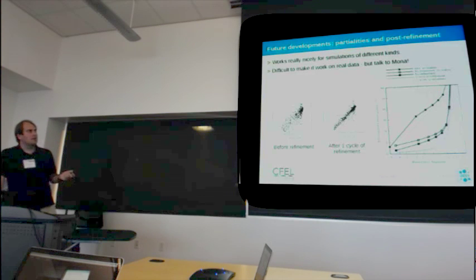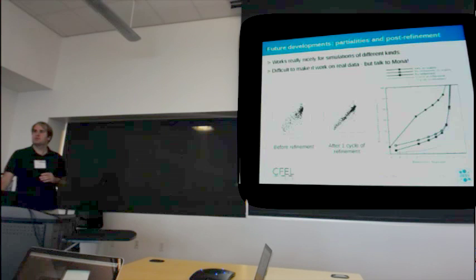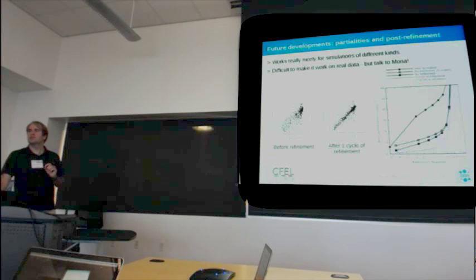Yes, it works. On the left, what I've shown is a nice visualization: on the x-axis is calculated partiality, and the y-axis is observed partiality. Each dot here corresponds to one reflection. Calculated partiality is what the model says the partiality of the reflection should be.